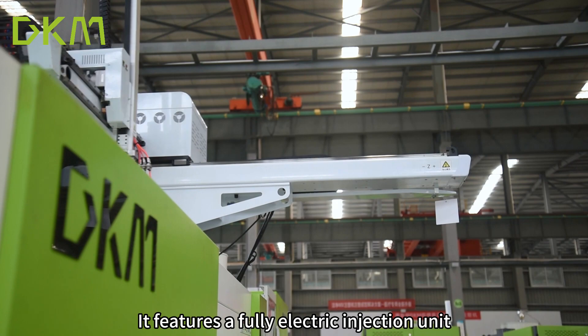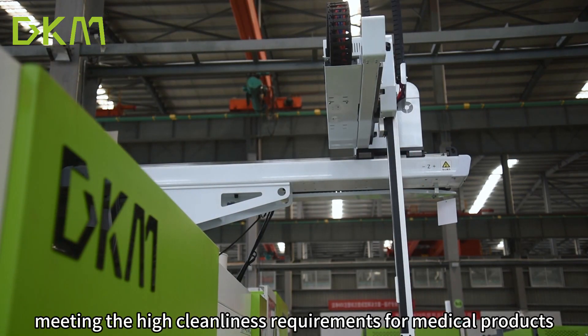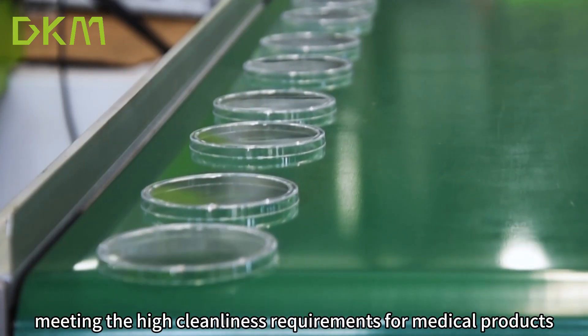It features a fully electric injection unit, meeting the high cleanliness requirements for medical products.